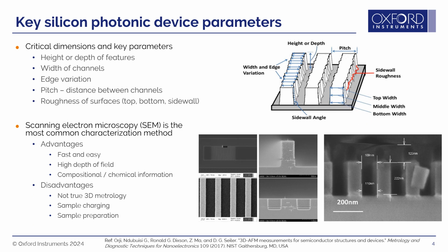As I've said, we'll largely be confining ourselves to discussing the metrology of waveguides and diffraction gratings. Though different in function, these often have similar nanostructures consisting of rows of parallel trenches. The terminology used varies with the specific types of waveguides and diffraction gratings. Sometimes we refer to the ridges or ribs of the device, or sometimes the trenches or slots that form the device. But whatever nomenclature is preferred, the critical dimensions and key parameters that affect performance often present similar metrology needs.